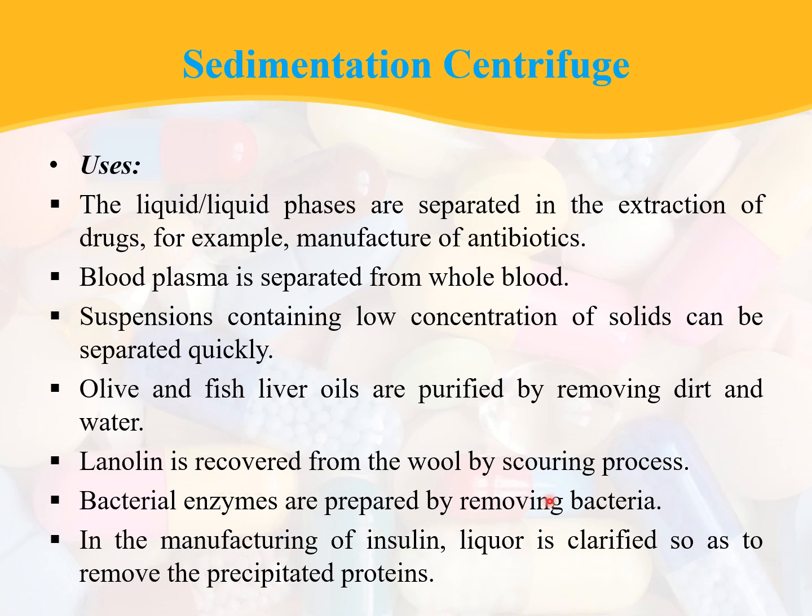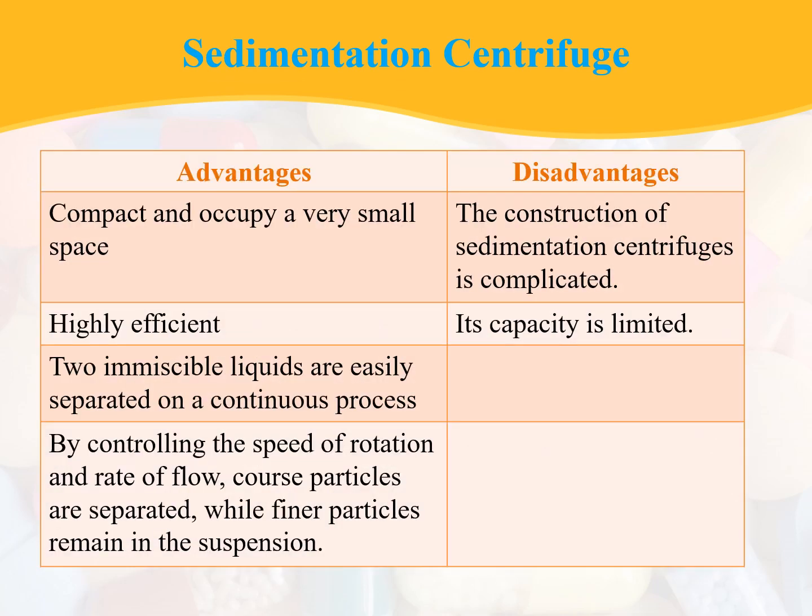Lanolin is recovered from wool by the scouring process. Bacterial enzymes are prepared by removing bacteria. In the manufacturing of insulin, liquor is clarified to remove the precipitated proteins.